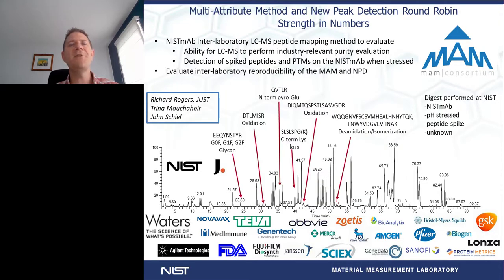So as you can see, this is an extremely complicated method. There's a lot of data processing, a lot of data acquisition that goes into proper performance of the multi-attribute method. So what we wanted to do was really evaluate how well this assay is being performed across industry, but also identify areas that we can work together to improve the method to really allow implementation in both the product development or process development side, and hopefully eventually into the quality control environment.